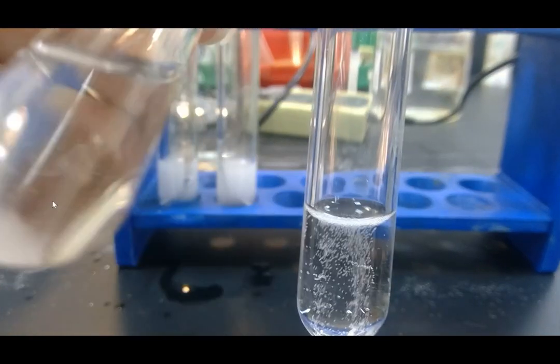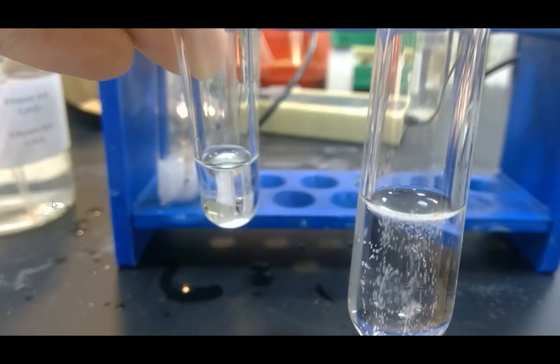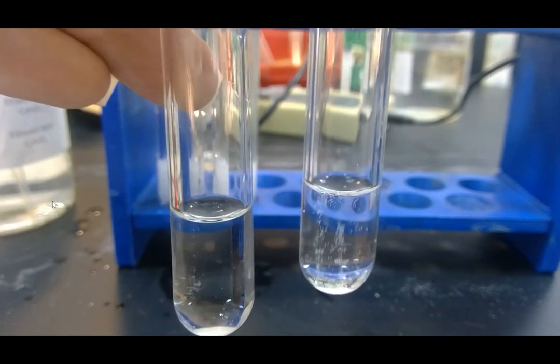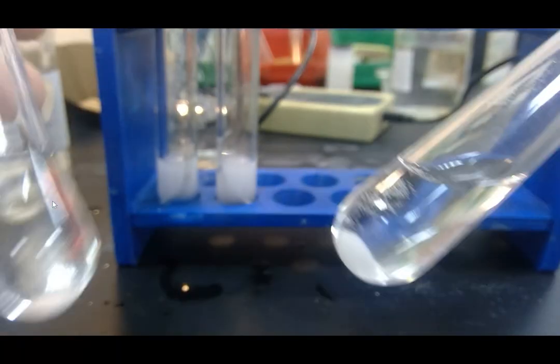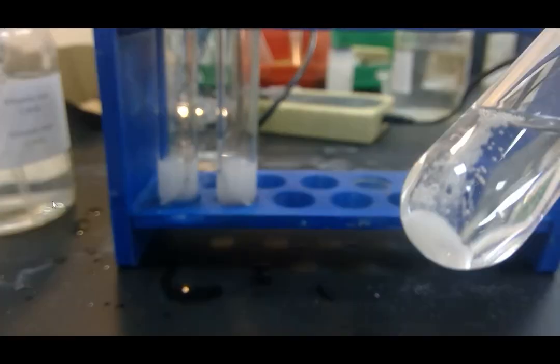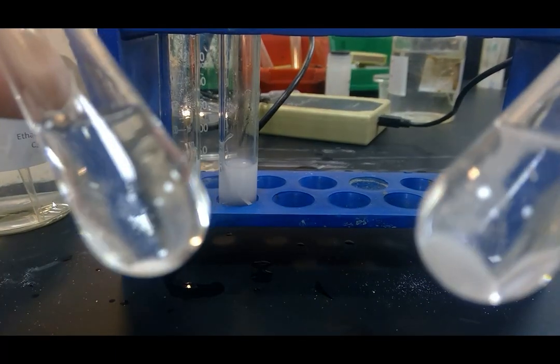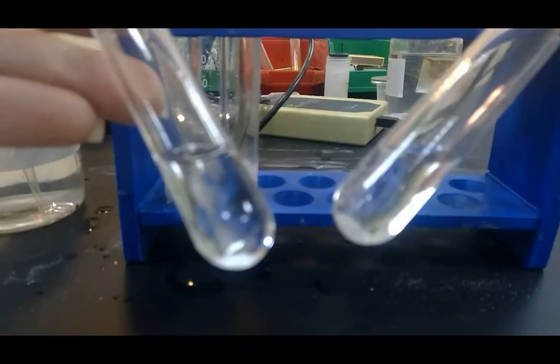We can see that the reaction with the hydrochloric acid is finished, whereas the ethanoic acid one is still producing bubbles because there is still some carbonate left in that tube. More carbonate is left there, whereas in the hydrochloric acid case, it's pretty much entirely reacted. The other one here is still fizzing up.